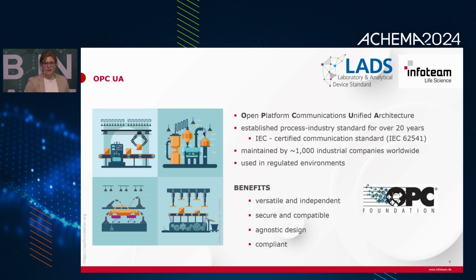So as I already mentioned, LADS is based on OPC UA, so it's an official companion specification. As you might know, OPC UA is an established industry standard with an architecture to describe and exchange machine data. Thereby, it's even more than a communication protocol because it also includes data models and interaction concepts.